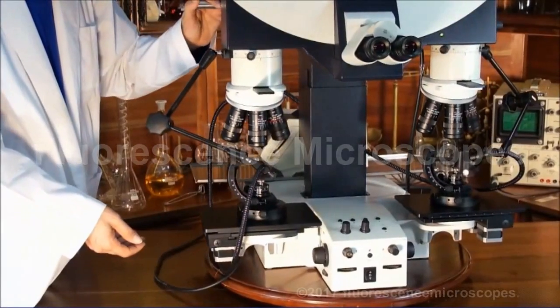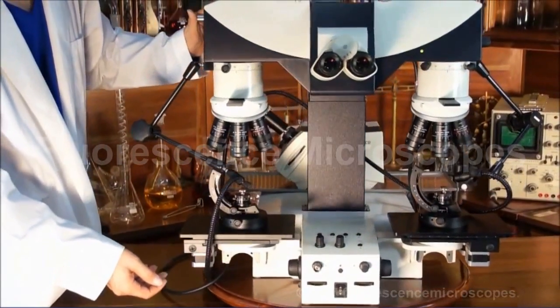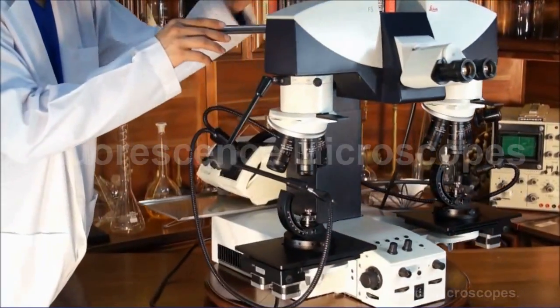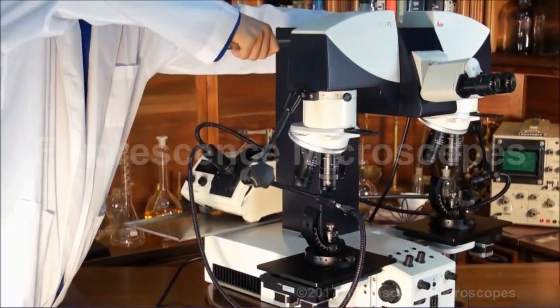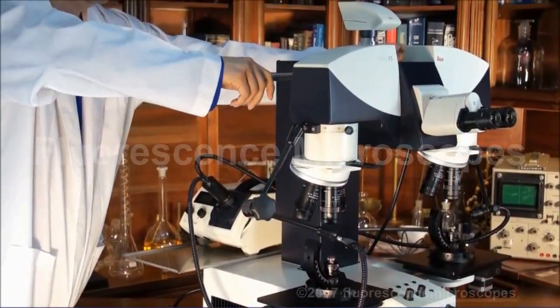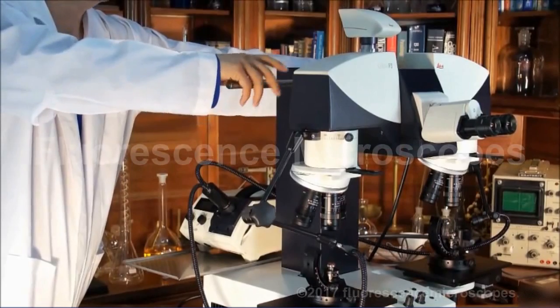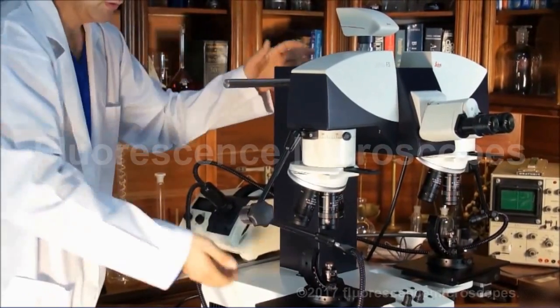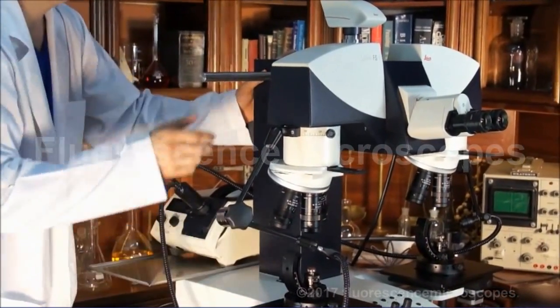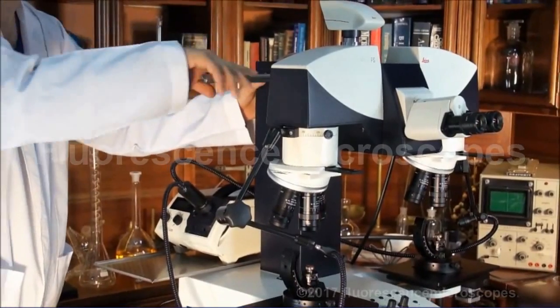This is all motorized, and it's got some very convenient carrying handles on the top. This is a very large and heavy microscope. These carrying handles are very needed. It's also a good idea to put your hand down below too when you're carrying. I wouldn't trust all of the weight just on these handles.